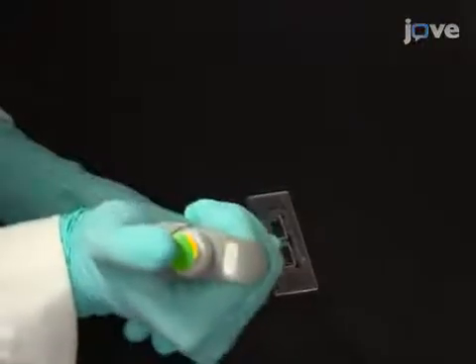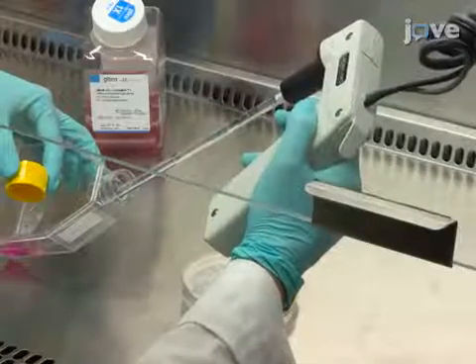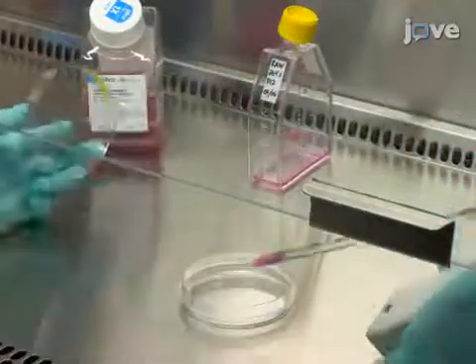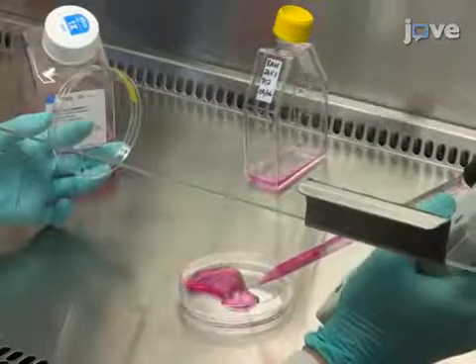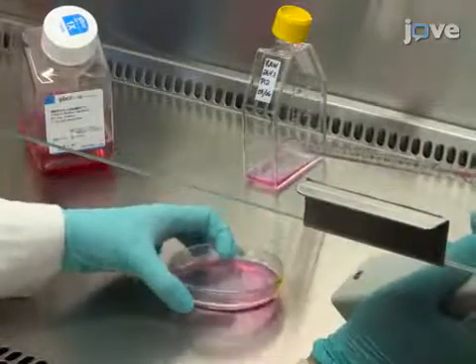With Trypan Blue, count the number of cells and use pre-warmed complete medium to plate them at a density of 8,000 per square centimeter in a 100-millimeter tissue culture dish. Then use complete medium to adjust the volume to 10 milliliters for a final concentration of 50,000 cells per milliliter.